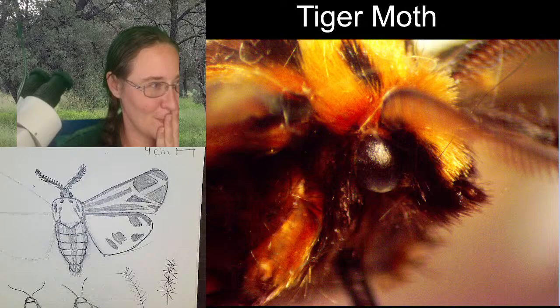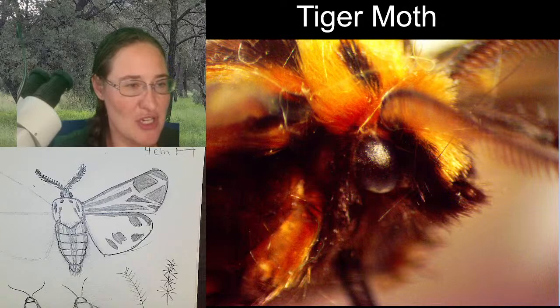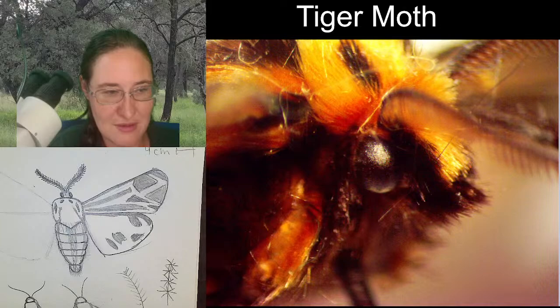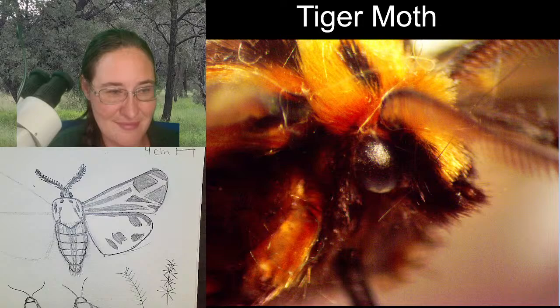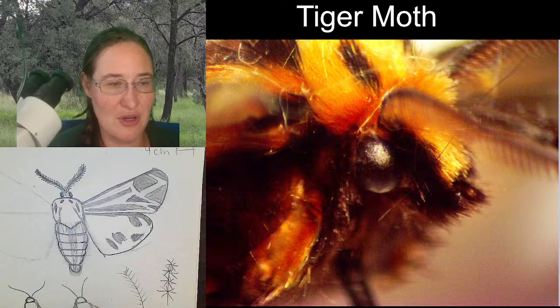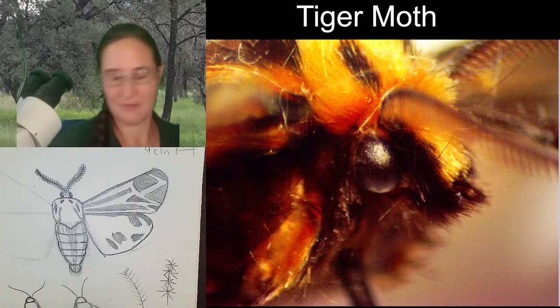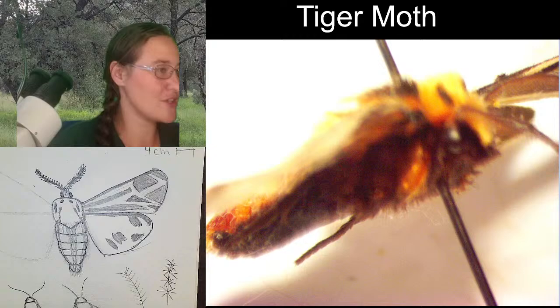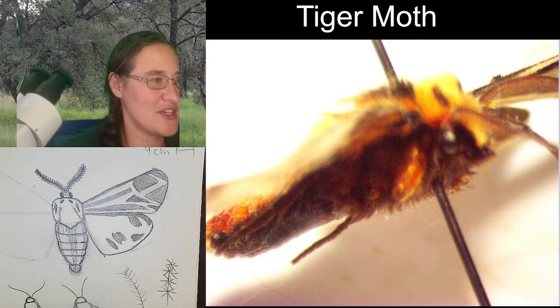Makes me wonder about color. Maybe there are creatures with specialized eyes. Oh, that's so true. How cool is that? He told me that some insect eyes change in death. Cool. So now I understand why you were having difficulty seeing where the legs are connected and how the coxae are connected, because it's all just floof.